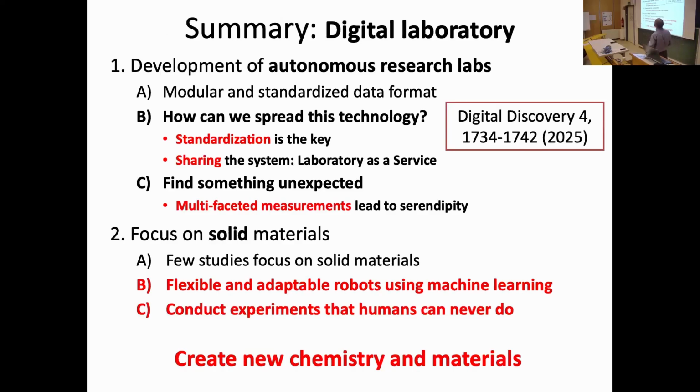So this is the summary slide: development of autonomous research labs. We are going modular and standardized, and we use 1 centimeter by 1 centimeter, which can also adapt 1 centimeter 5 samples. If you standardize the module to 1 centimeter by 1 centimeter, then you can immediately use these systems.